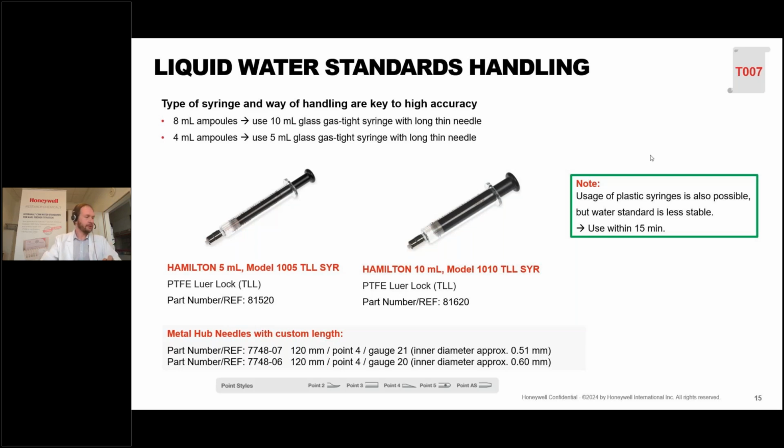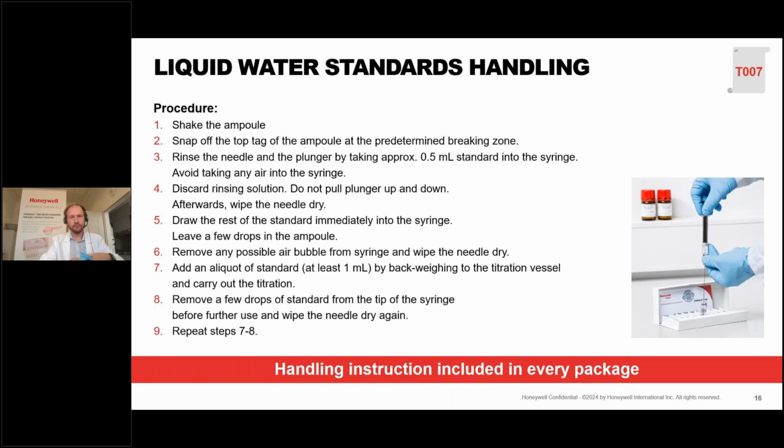Okay, so at this point, I would like to show you how we recommend to handle our liquid water standards correctly. So now we have the webcam, I can also show you something. So let me check. In general, this protocol can also be used for all liquid samples, not only for water standards, but I will show it to you with our water standards.